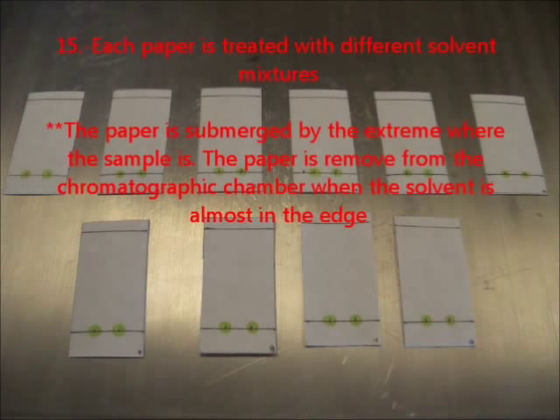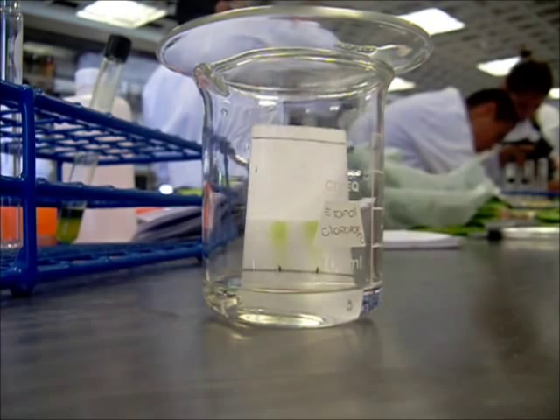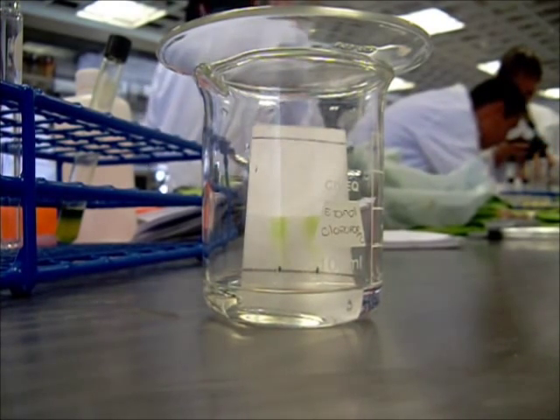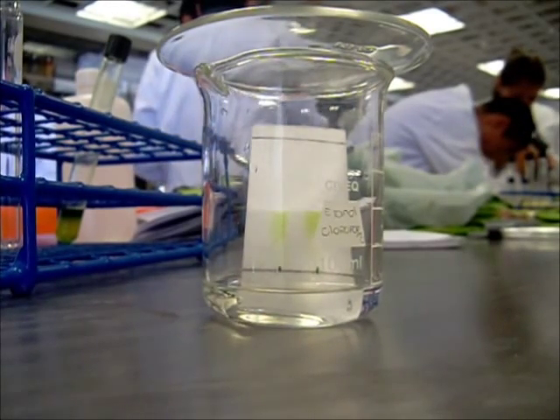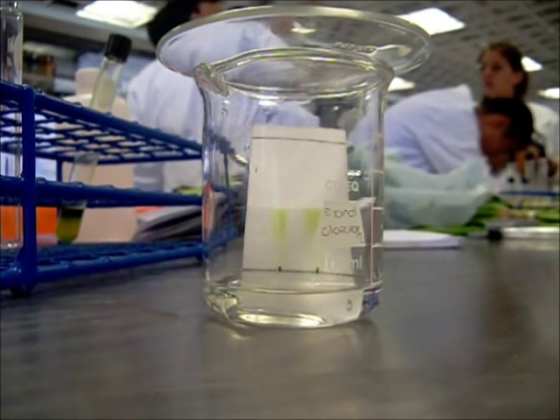Each paper is treated with different solvent mixtures. The paper is submerged by the extreme where the sample is. The paper is removed from the chromatography chamber when the solvent is almost at the edge.